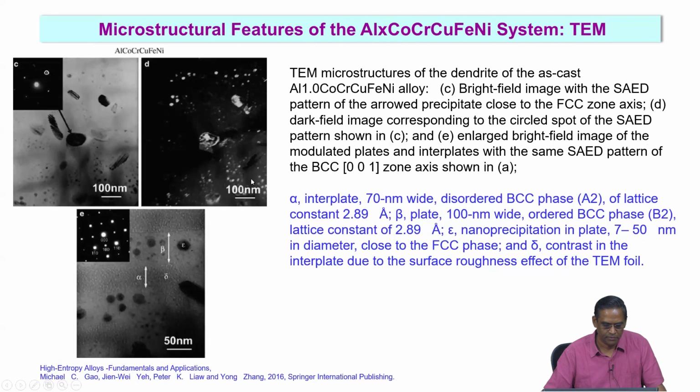And then if you zoom into this white domain area, you see a layered structure, okay. You have one layer here, another layer here, another layer here. So alpha, beta, you can see it layer by layer. If you look carefully, then again as I told you, you have these fundamental reflections pertaining to 001 zone axis, and then you have superlattice reflections shown here. And what we learn from this is summarized here.